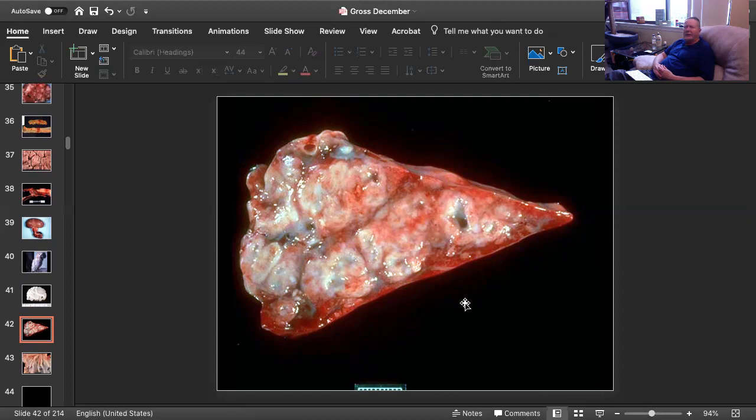These look really ooey gooey, and they don't look very much like the typical caseating pyogranulomas that we see. But TB is a related organism, and Rhodococcus shouldn't be ruled out, because occasionally they will look like they have a very liquefied center. They will look like abscesses, but you're probably looking at Rhodococcus equi. A lot of these animals might have some form of mild immunosuppression. And what happens is that 100% of these animals have pulmonary lesions.